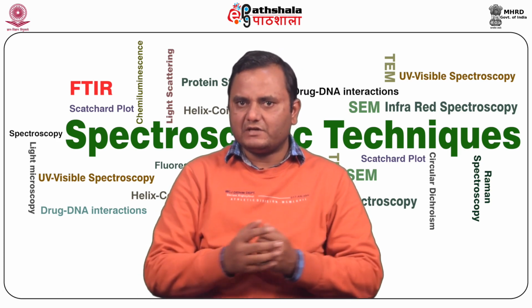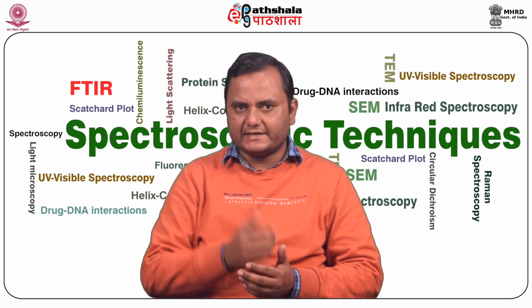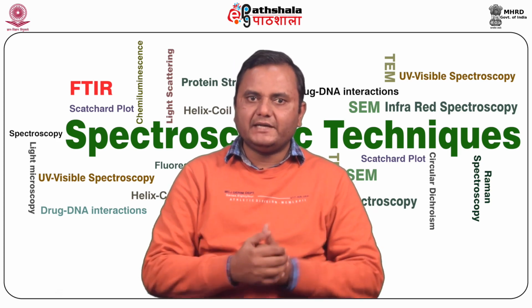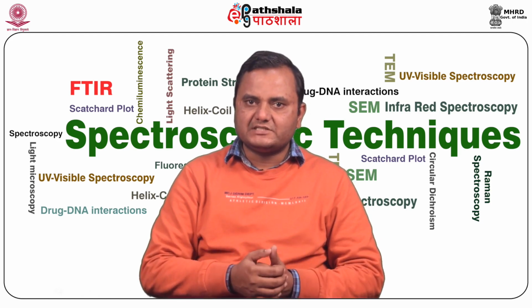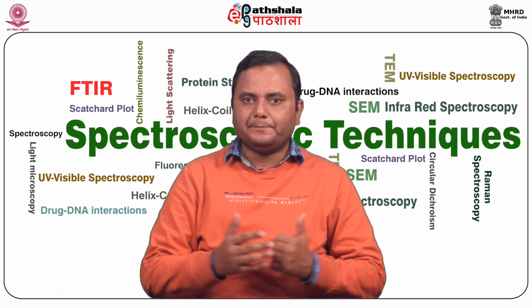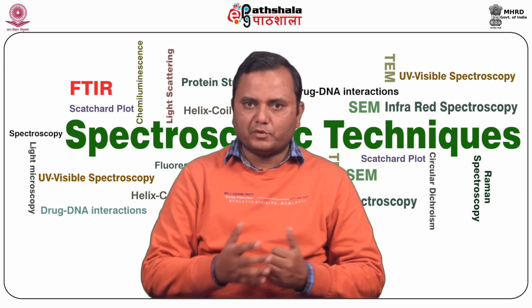These are well-known online servers used to estimate the secondary structure content in a protein, like SSE, known as secondary structure estimation, Contin, CDSSTR, Selcon, self-consistent, Lincomb or CCA, then BPN, which is based on the neural network method, SOM-BPN, and PROT-CD.